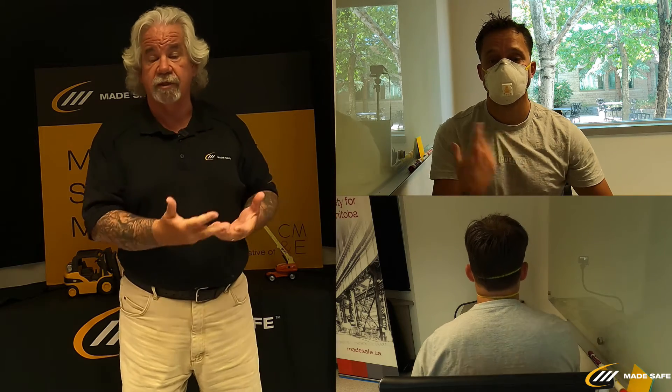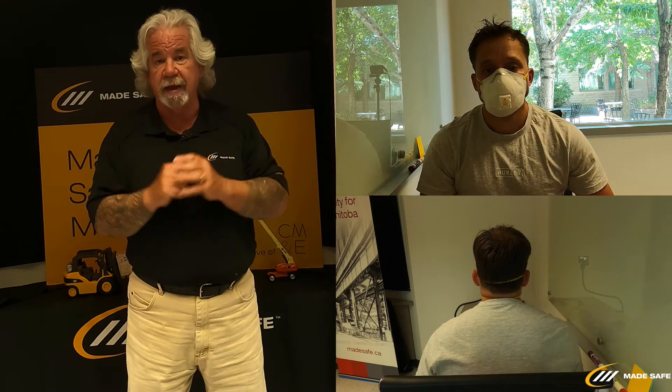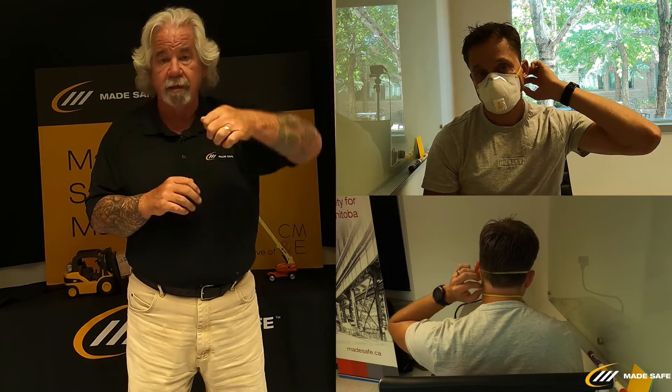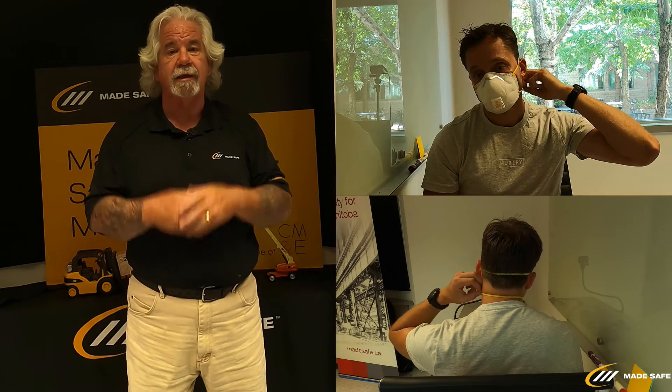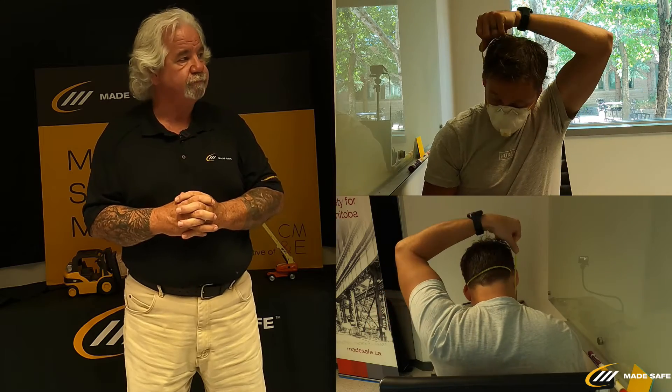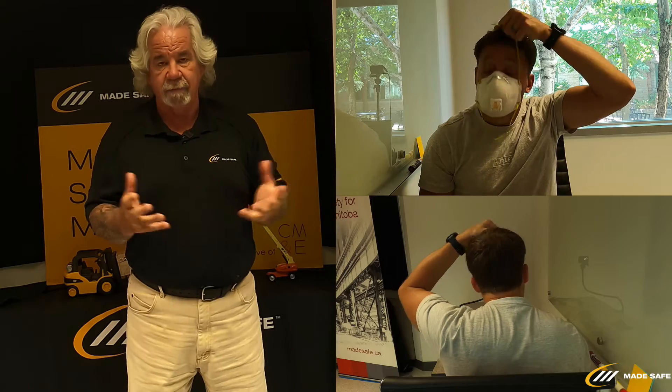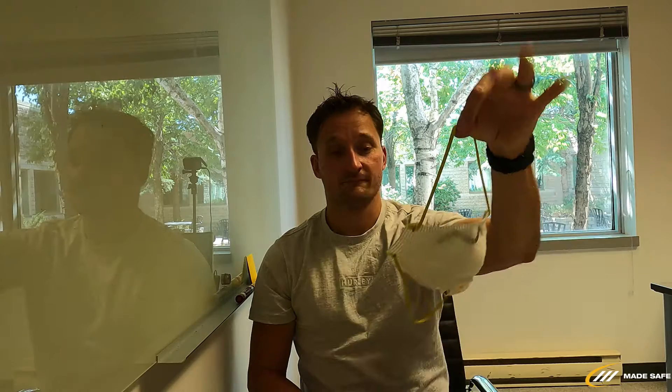If any air is escaping as he breathes out, we would adjust the mask accordingly. For doffing the particulate mask, we do not want to touch the mask with our hands. Reg will reach with one hand and bring the strap that's over his neck up and over the top, then grab the top strap and take the mask off without touching it. If the mask is contaminated in any way, you can just discard it.